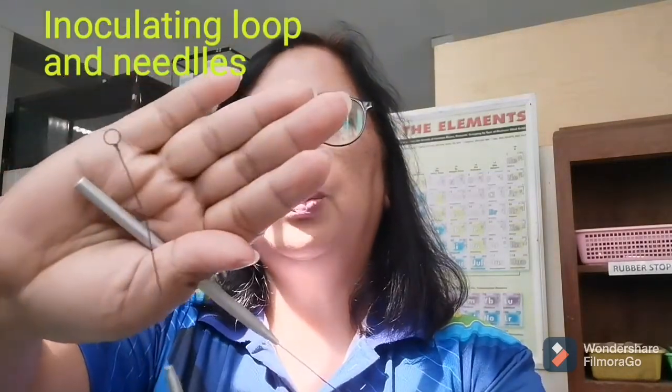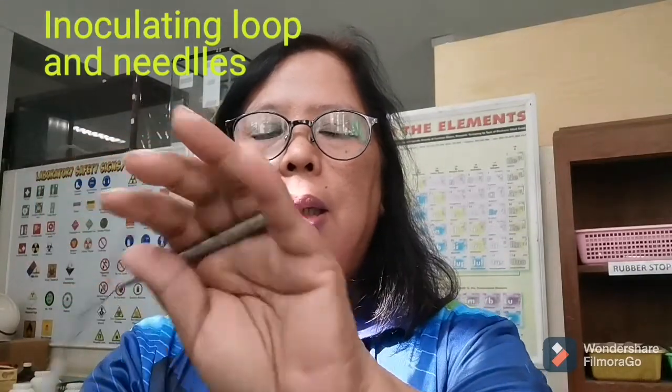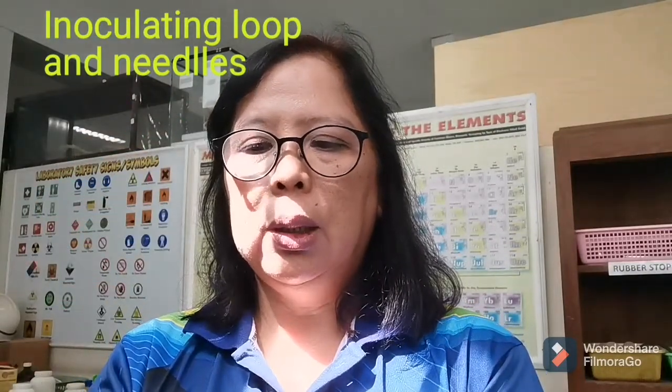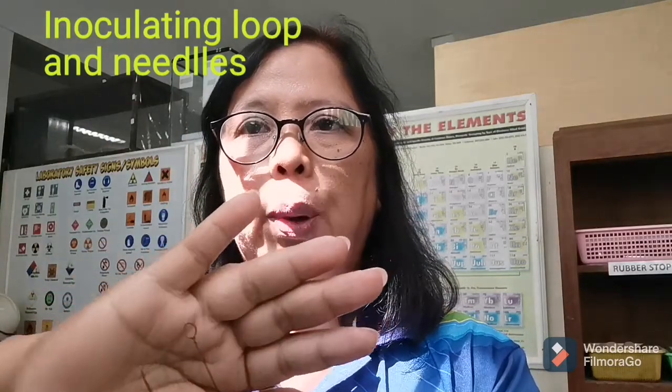You have there the loop, and you have also here the needle. Both of these will be used to spread the microorganism to be placed on your glass slide.